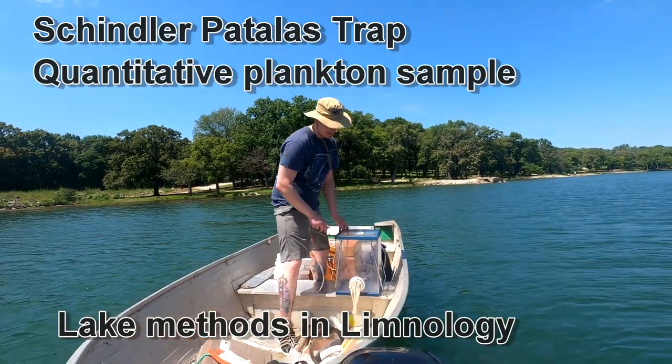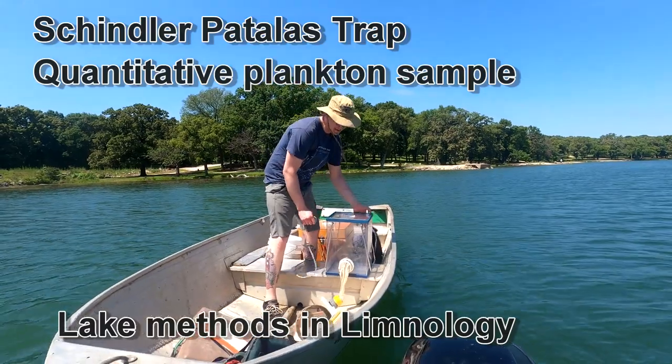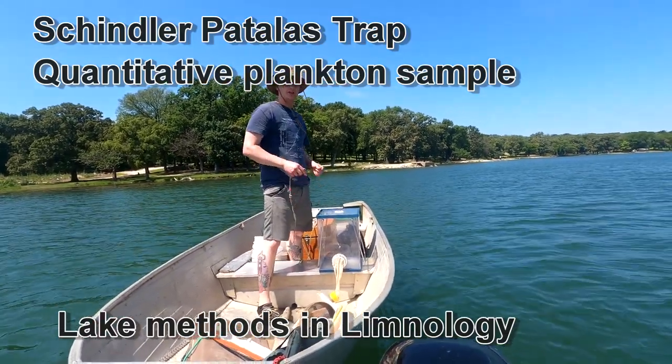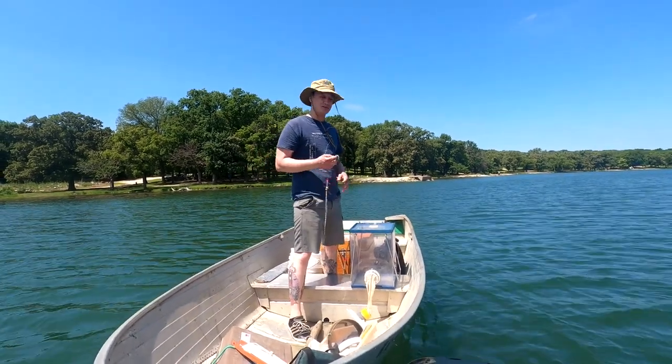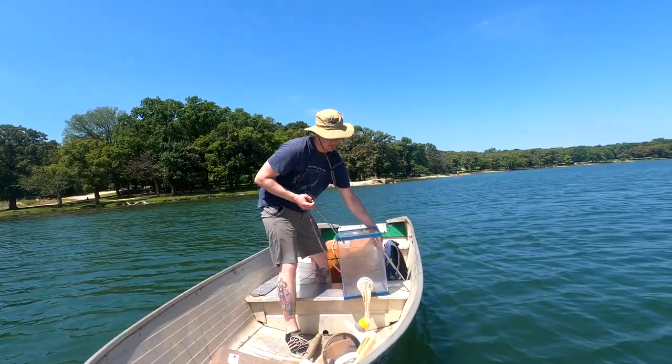This is a Schindler-Patalas trap. It's used to sample zooplankton in lakes. It's a clear box, and it's clear because the zooplankton will actually avoid any colored objects — this is an attempt to avoid predators. So it's clear to make sure we don't scare the zooplankton out of the way.